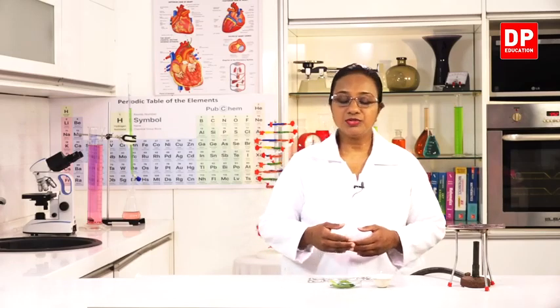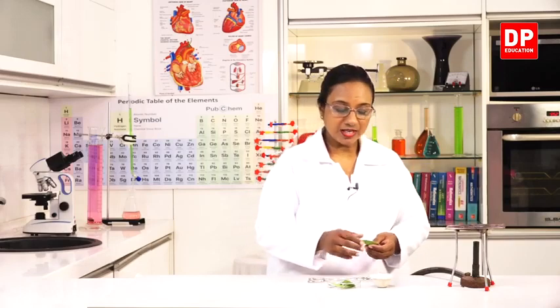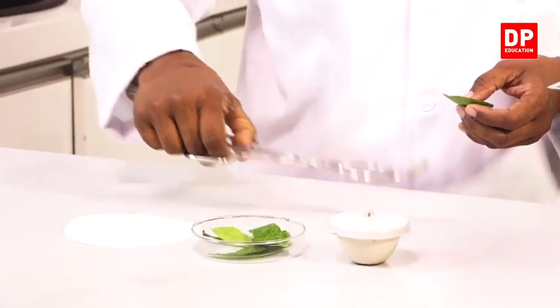For this again, you can use any solid food sample, leafy vegetables, piece of fish, meat, anything can be used. Today I am going to use these leaves. I will take a few of these leaves, and you all know for high heating we will be using a crucible with a lid.